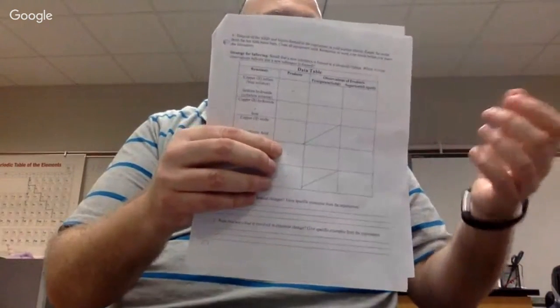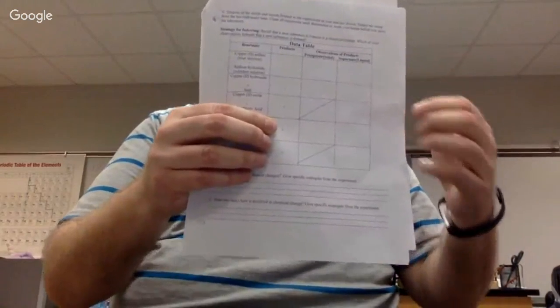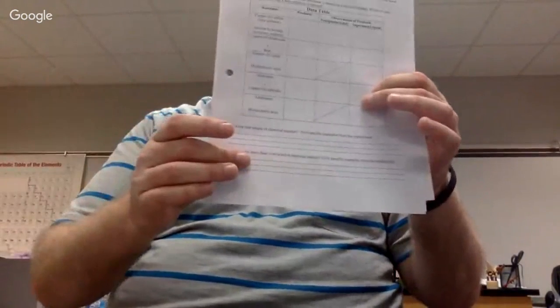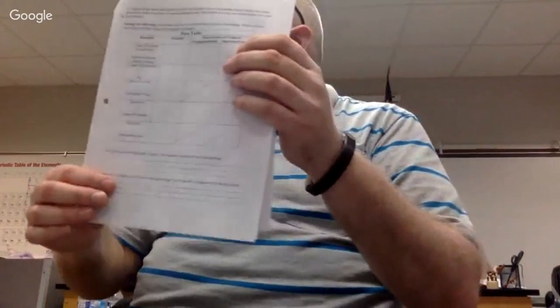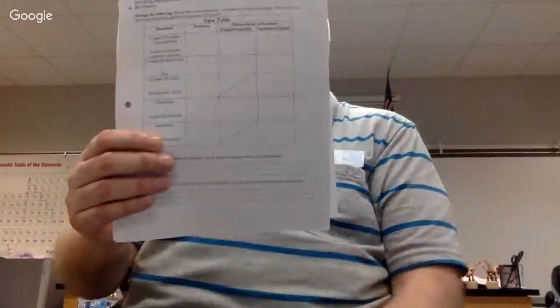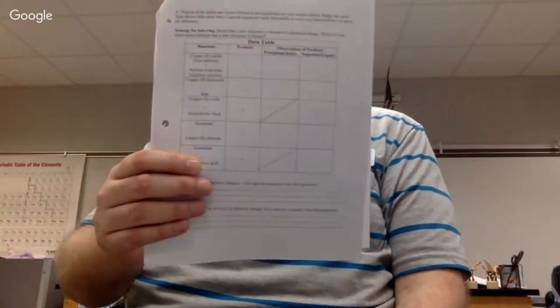Is there anything growing on it? What does it look like? What's changing? And then also what's going on in the liquid. Is the liquid changing color? Is there anything going on in the liquid? The bottom one is what's happening with gas being generated. So you're aware, when you take aluminum and hydrochloric acid, you're going to end up with aluminum chloride and hydrogen gas.